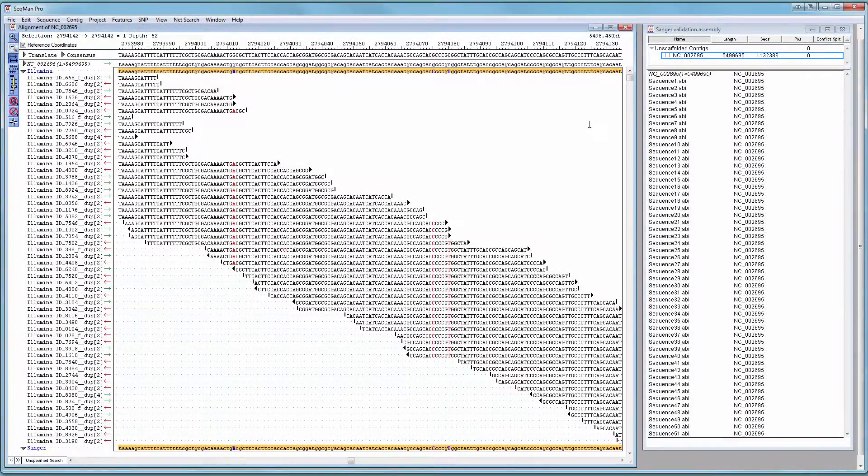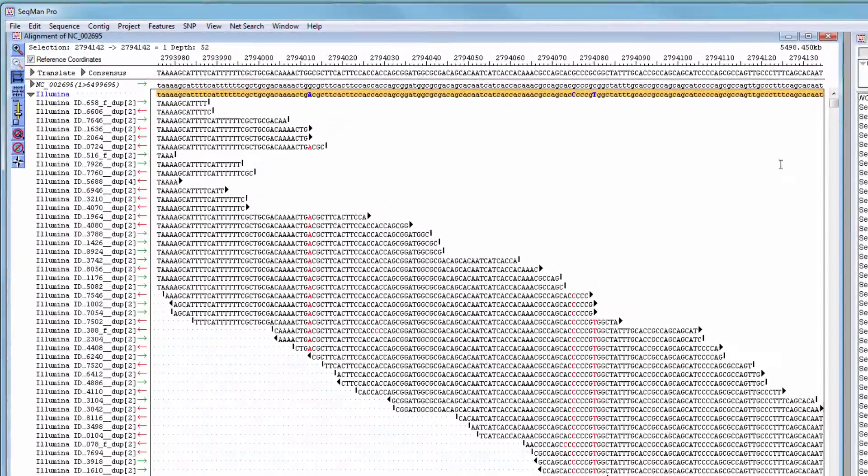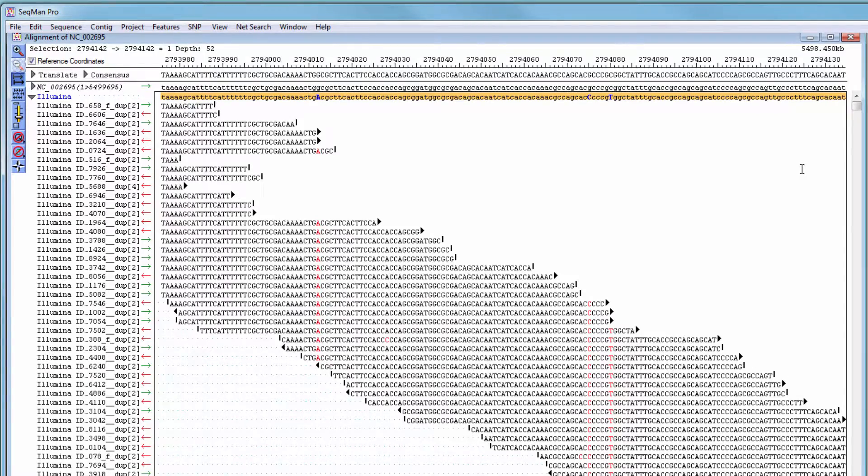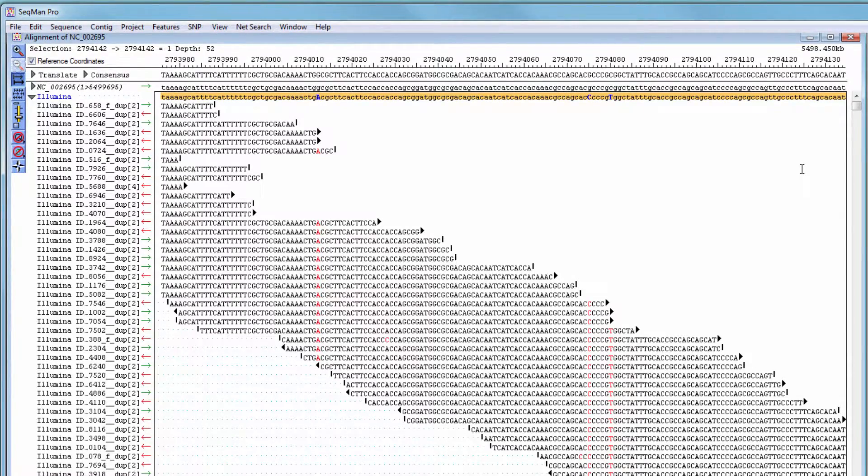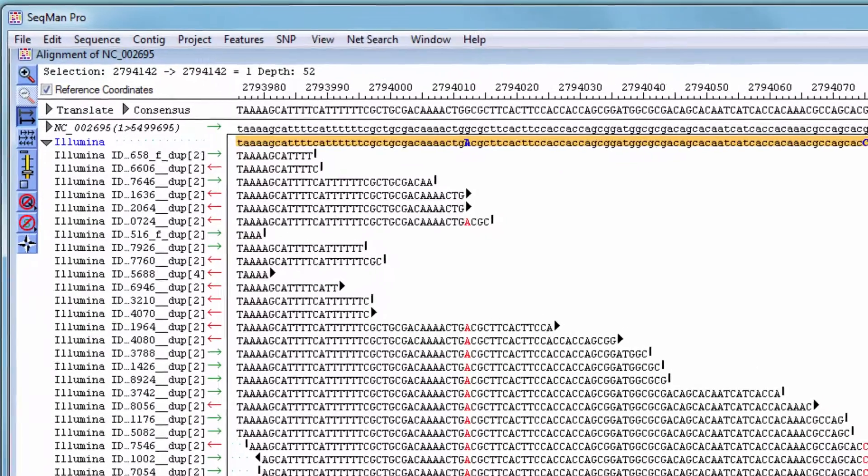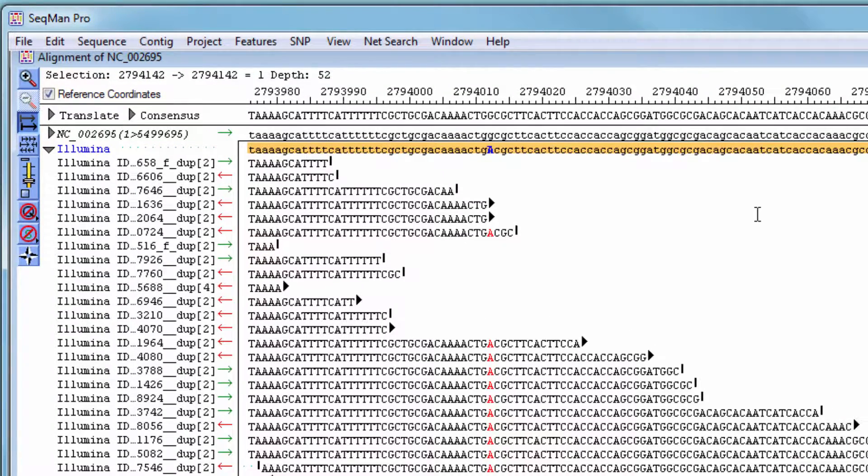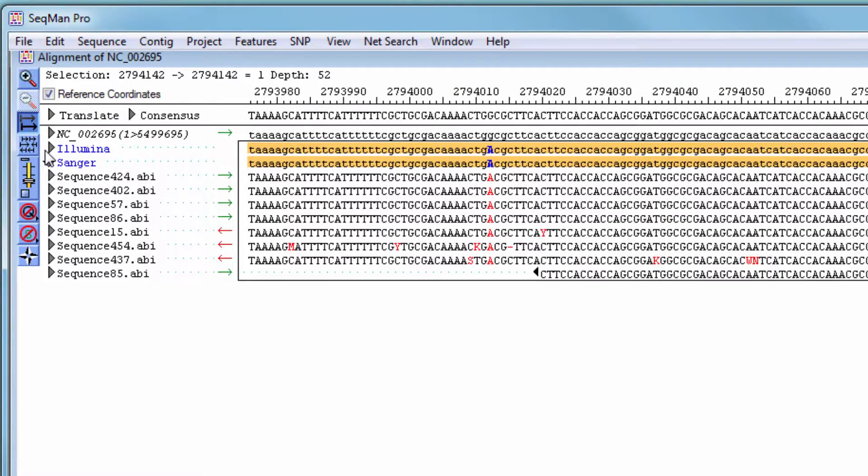After the assembly is complete, open the results in SeqMan Pro. Here, the Illumina and Sanger reads will be binned into separate sub-alignments, each with their own pseudo-consensus sequence shown in gold.